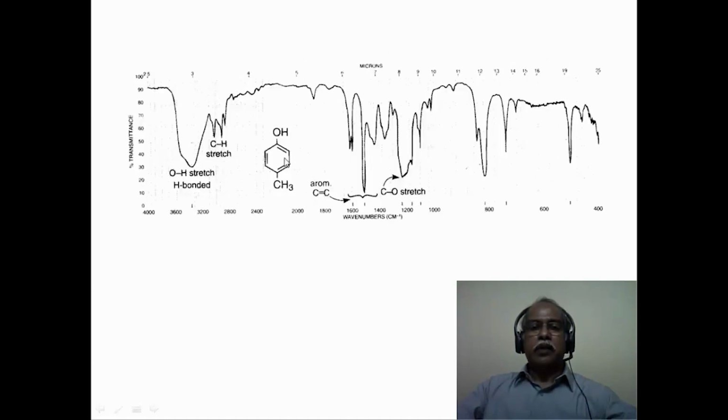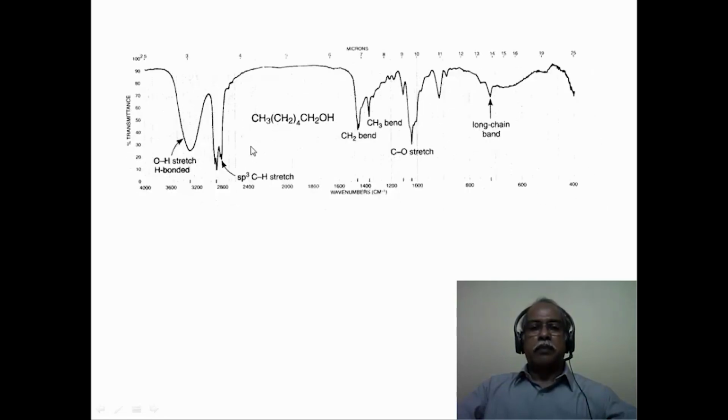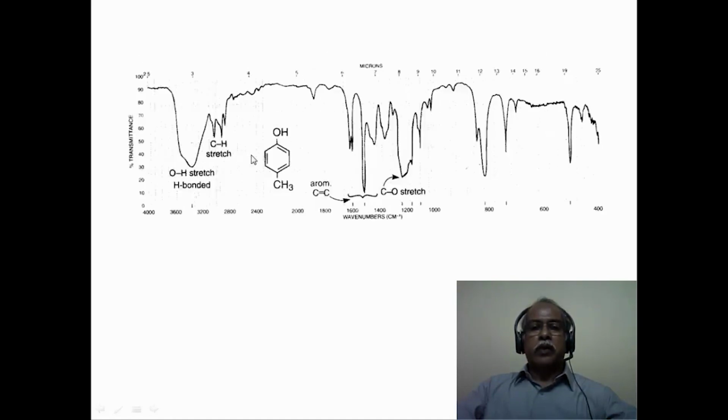In the case of phenol also, you will have the sp2 CH band. You can see the gap between these two bands is fairly high in the alcohol, because this is around 2800. When it is moving to an sp2 closer to a 3000 region, it is closer to the OH peak, for example. The OH broad peak that is seen here is essentially because of the hydrogen bonded OH stretching frequency of the phenolic compound here. In addition to the CO stretch which comes here, because of the C double bond C being present in this phenolic molecule, one can also see the C double bond C stretching.